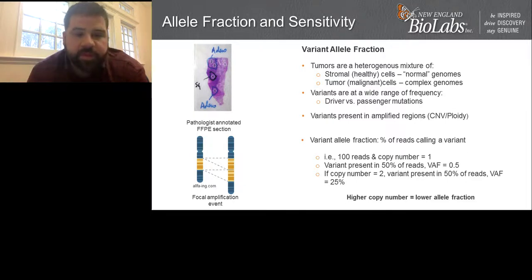And as we think about things like cell-free DNA and those applications where we really want to push the variants in terms of looking at these driver mutations early on, those tend to be down into the 0.1% where you really need to get high depth of coverage in order to have enough chances to actually see it, because you'll only be seeing that variant in 0.1% or 1 in 1,000 reads. And if you want to get 10 reads, that means you're going to have to sequence to a depth of roughly 10,000x.